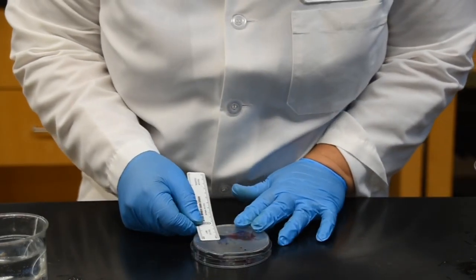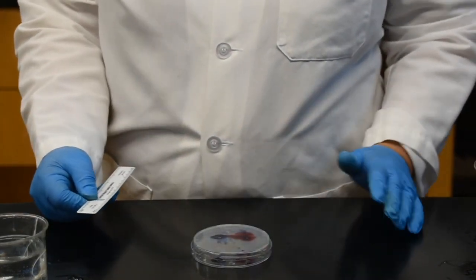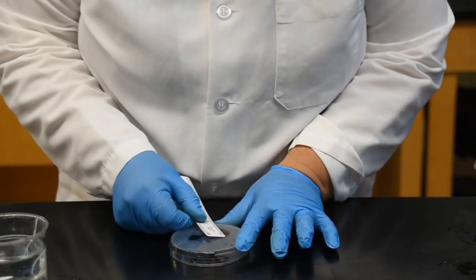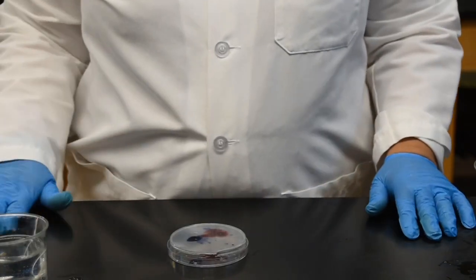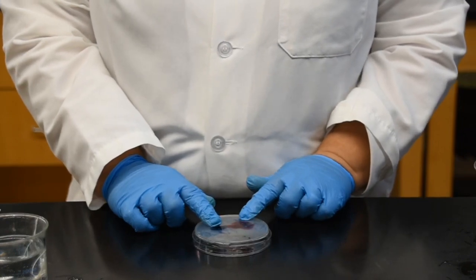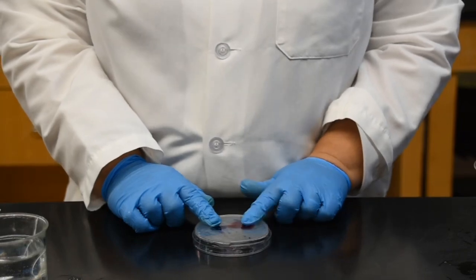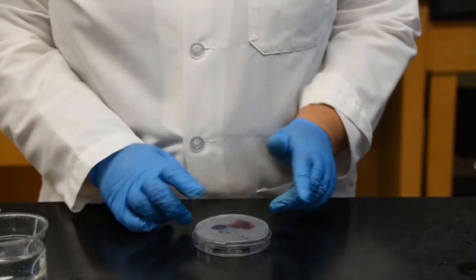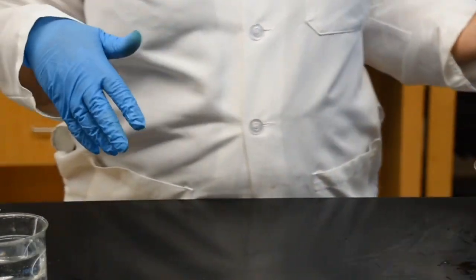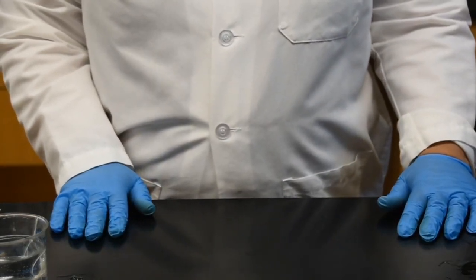For the first sample, which is my methylene blue, I have 1.2 millimeters, or sorry, 1.2 centimeters in terms of travel. And in terms of my potassium permanganate, I have 2.5 centimeters in terms of travel. So enter that data. Again, 1.2 centimeters for your methylene blue and 2.5 centimeters for our potassium permanganate. Now, based on that, answer the question you have. Does the prediction of lower weight implying faster diffusion rate hold true in your lab activity?